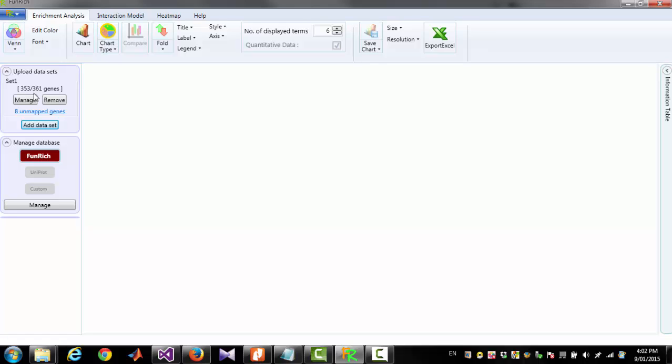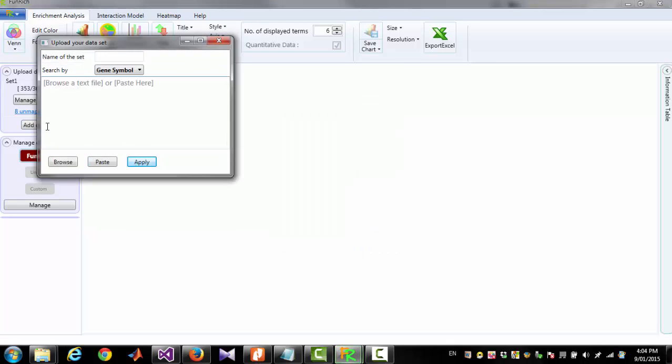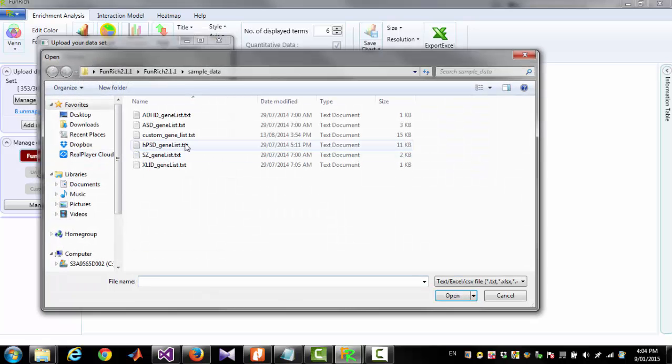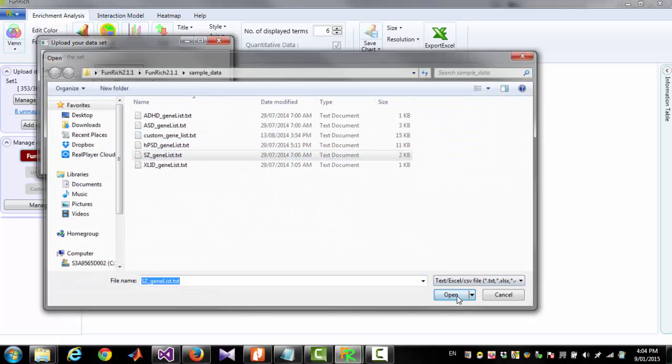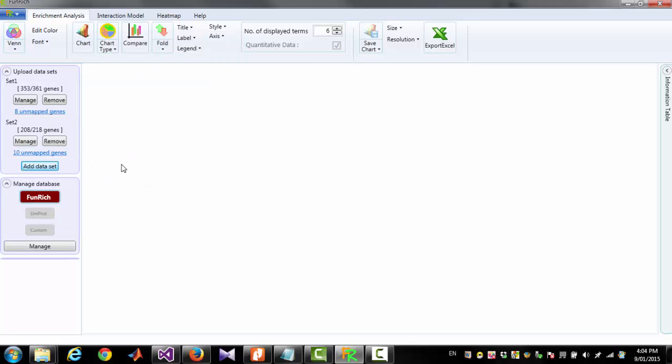You can see there are 361 names in the list but 353 of them are identified from the database. And these 8 names are not identified by the database. I am adding another dataset giving a name Set2 and clicking Apply.